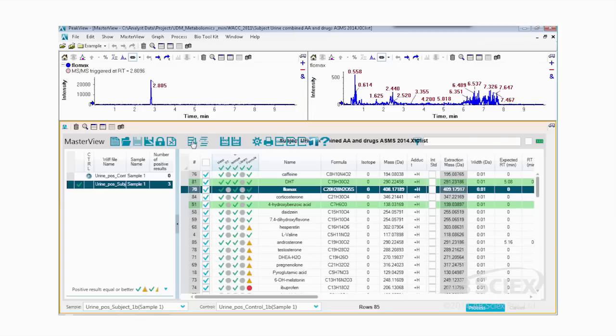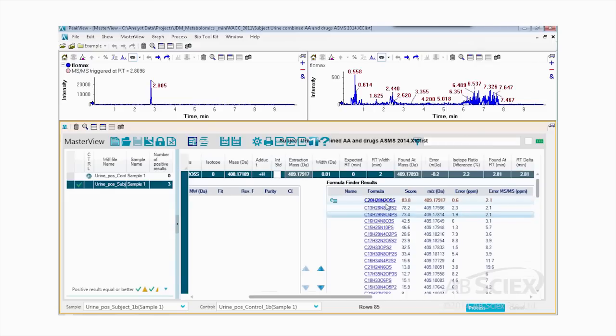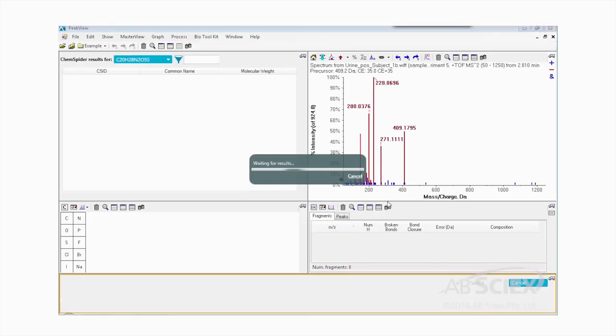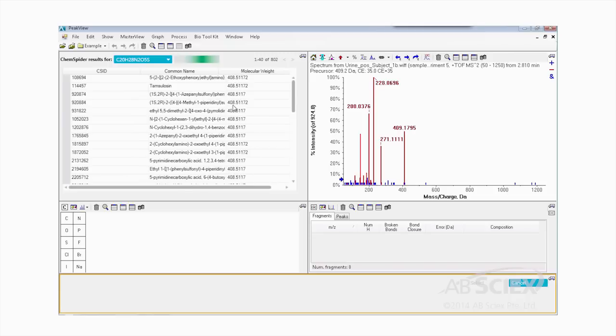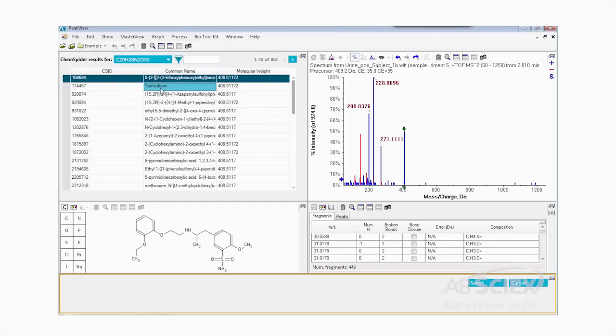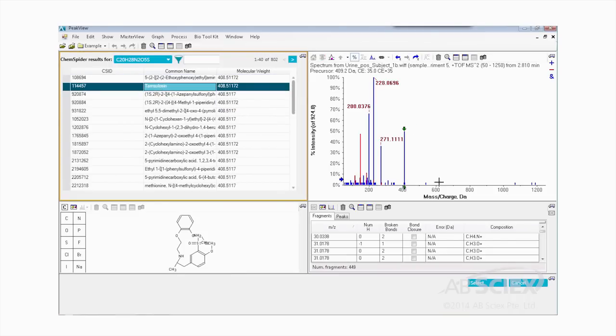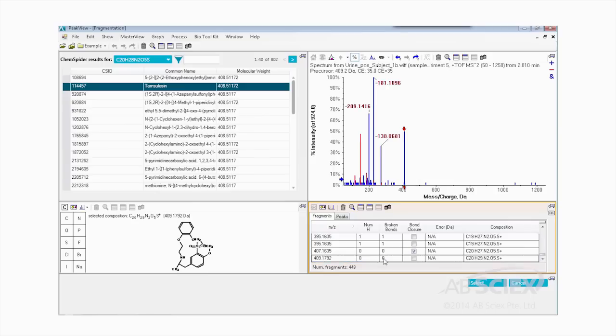MasterView software allows features of interest to be identified by calculating a chemical formula or structure through online database searching tools. Data can also be uploaded to external tools, such as XCMS Online, which allows the user to search the METLIN database. This data can then be imported back to MasterView for review. MasterView also has a built-in link to ChemSpider to match accurate mass formula and structures against the MS-MS spectra for structural elucidation and confirmation.